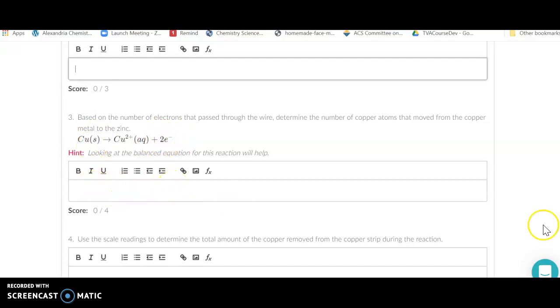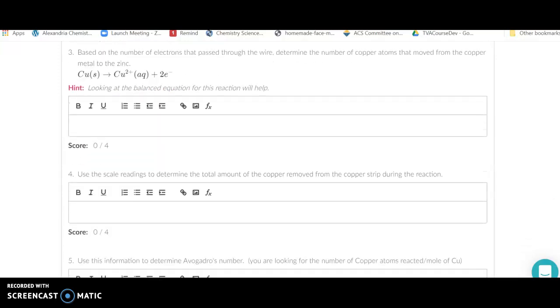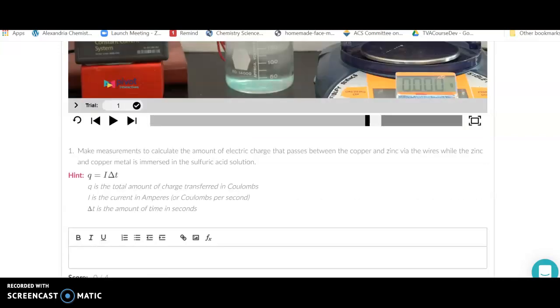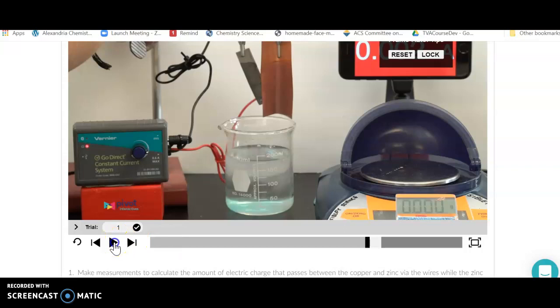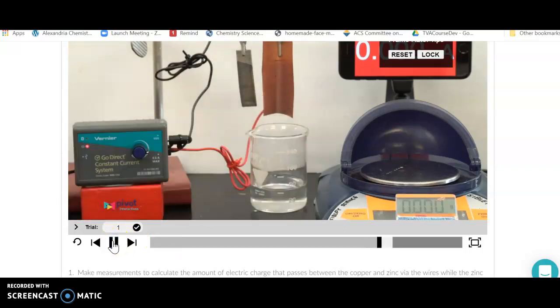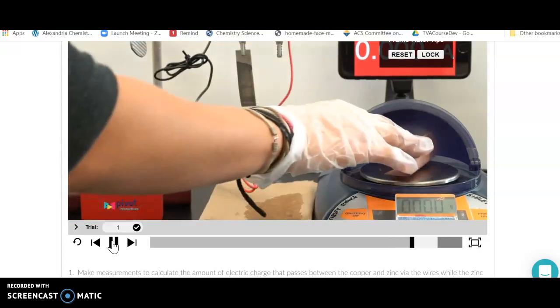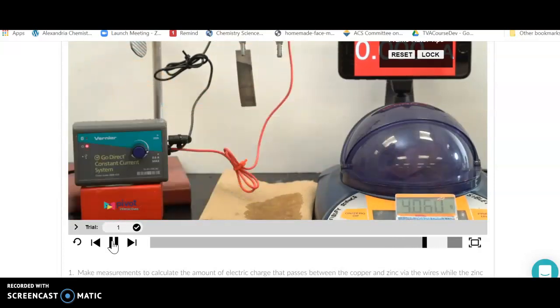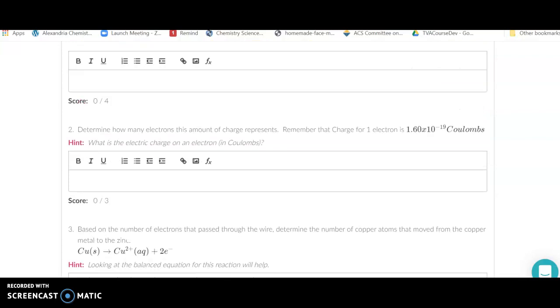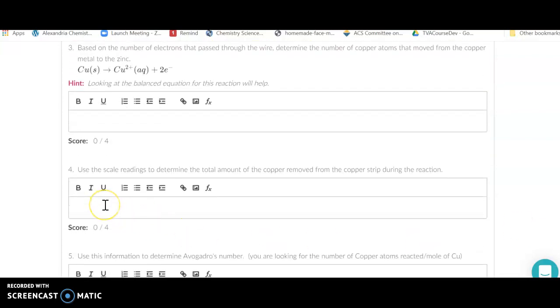The last thing we want to do is get atoms per mole. To do that we've got to figure out how much copper we have. If we go back to our scale and keep going on this experiment, it's going to take the piece of copper out, give it a rinse, let it dry, then take and put the copper sheet right back up here. The mass has gone down. The mass that was lost—the initial minus this value—is the number of grams of copper that has reacted.